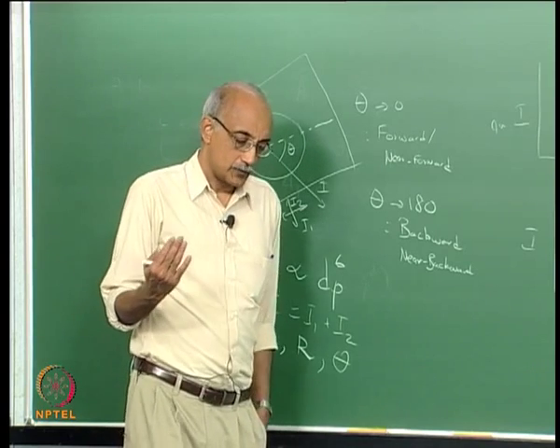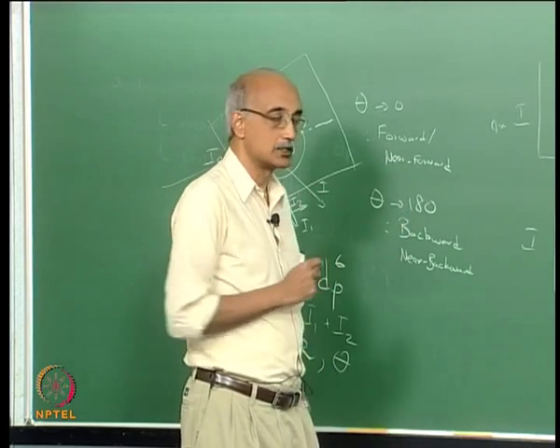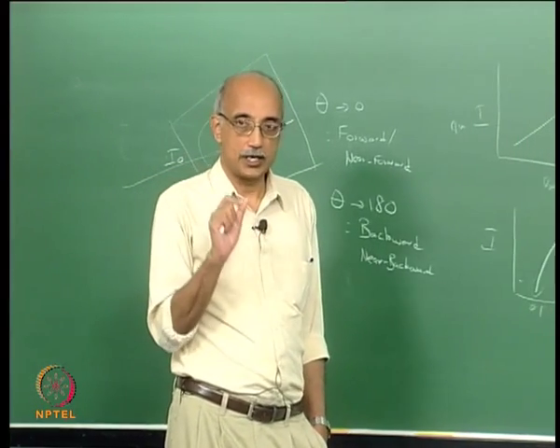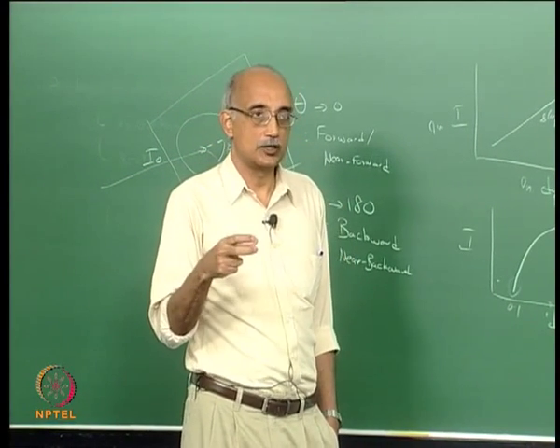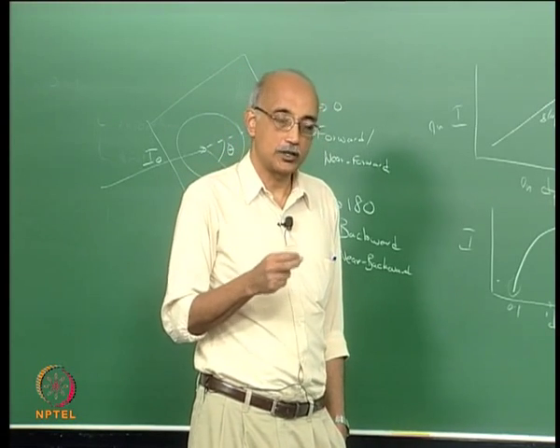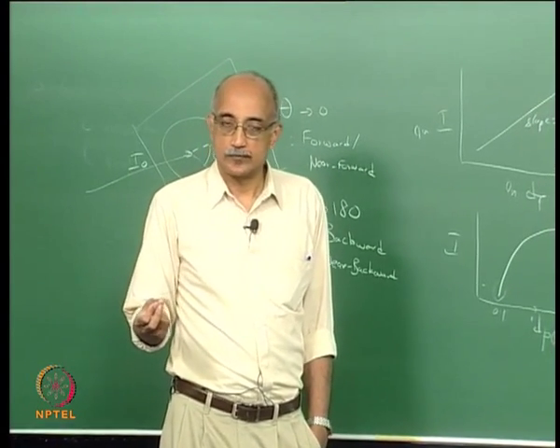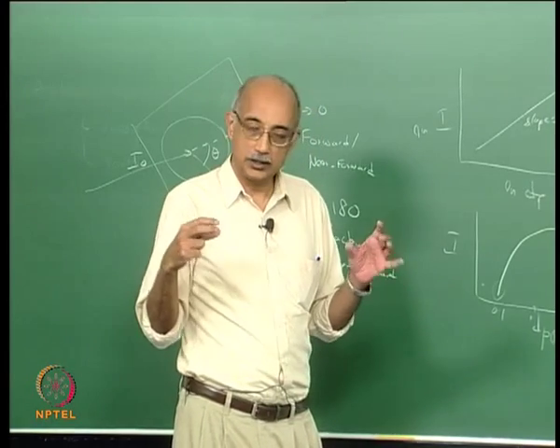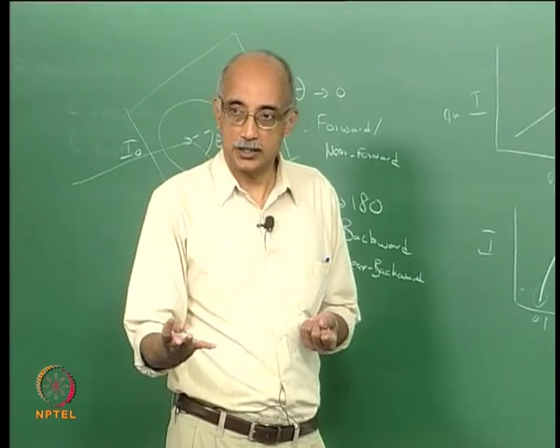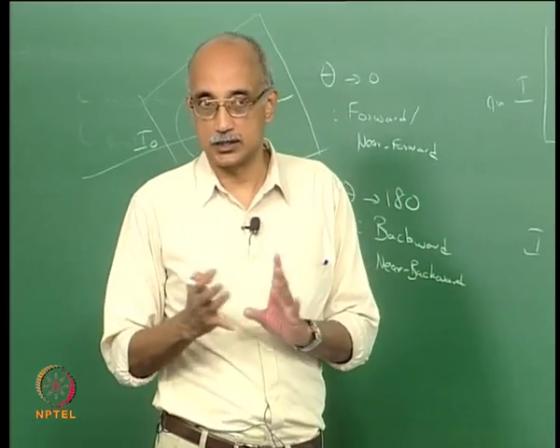So when you look at the light scattering characteristics from a single particle, and we will do this quantitatively in the next lecture, the key point is that there are many variables that affect scattered light intensity from a single particle, which makes the use of a particle counter that is based on light scattering somewhat questionable in terms of its validity, because two particles that are entirely different in size can give the same scattered intensity if some of these other parameters are suitably adjusted.